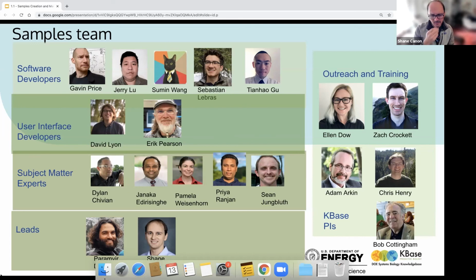And maybe one general other comment is we're still working through what attributes are inherently part of the sample and which attributes are some other form of measurement that might be linked to the sample. Certainly the amplicon data and the chemical abundance data are two examples of measurement data that are linked to the samples.